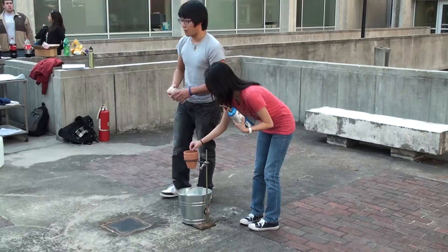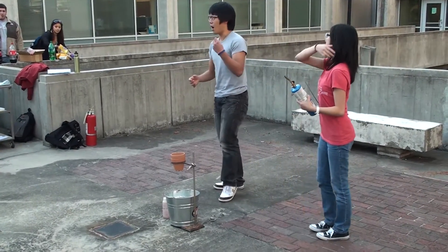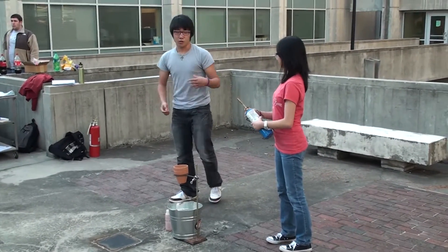This mixture is called thermite. As we mentioned, it's an extremely exothermic reaction and it happens really quickly. A lot of energy is going to be emitted really quickly, which is why I need to explain things now before it's lit.